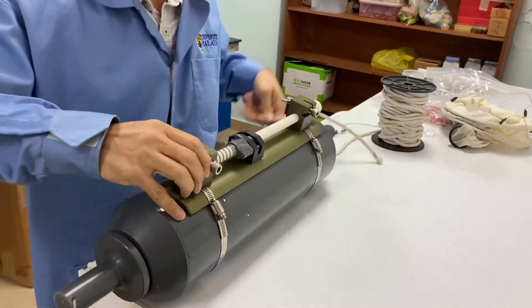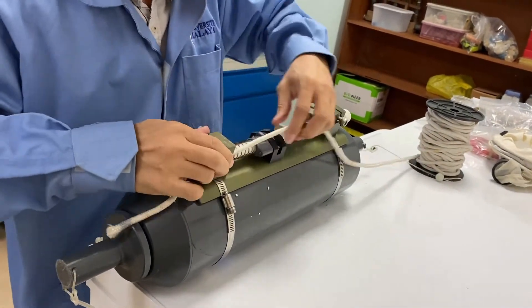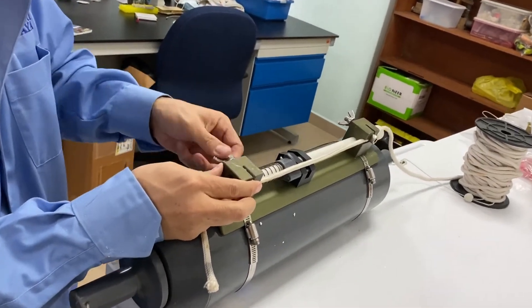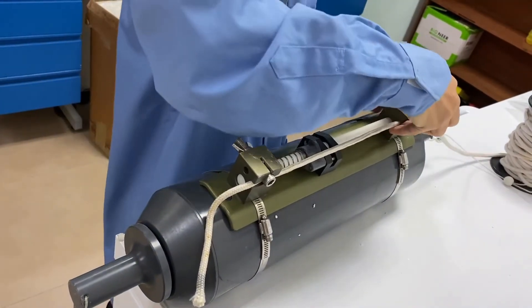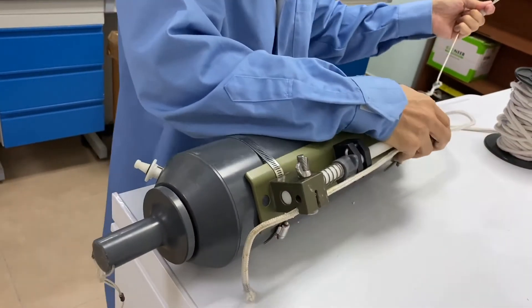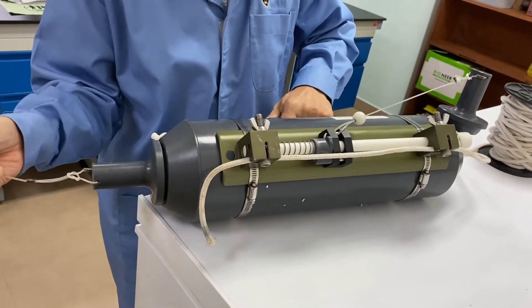For onboard use, you can latch the cable here and attach the cable here, then tighten it so that the cable is fastened. Then you can activate the sampler again and release the suction cups to prepare the sampler.